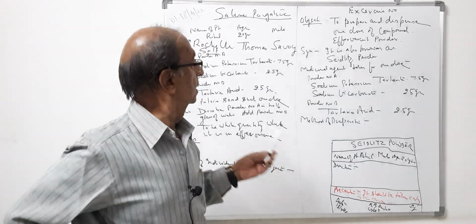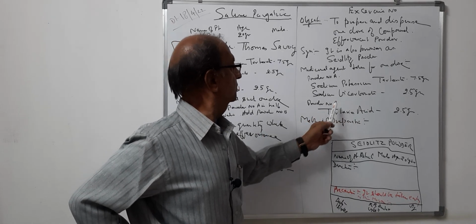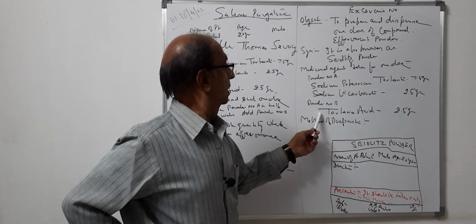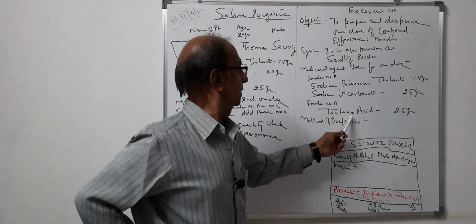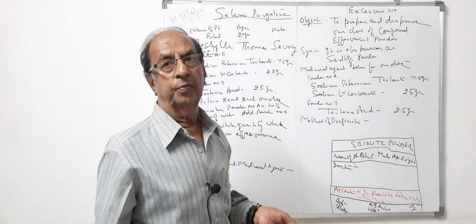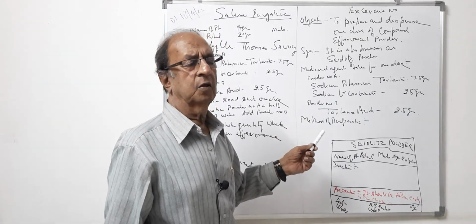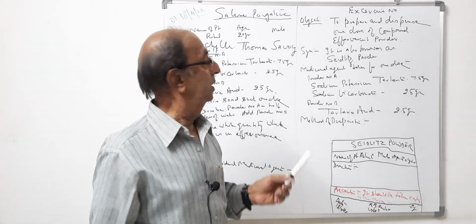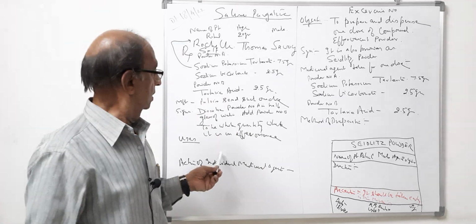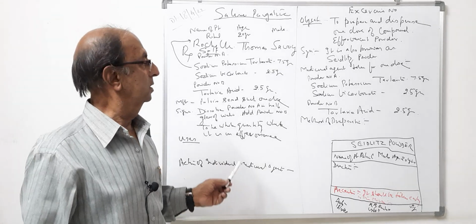If it is not tight, then there is a possibility that sodium bicarbonate, if in one wrapper, may react with tartaric acid. It takes vapors from the atmosphere and your powder will have interaction between sodium bicarbonate and tartaric acid, and there would be evolution of carbon dioxide in the paper. If you take that powder also, there would be action in the body, but it is not palatable. It is difficult to take 10 gram of solid by mouth without evolution of carbon dioxide, which gives a carbonic drink. So this is the reason, nothing else is there.